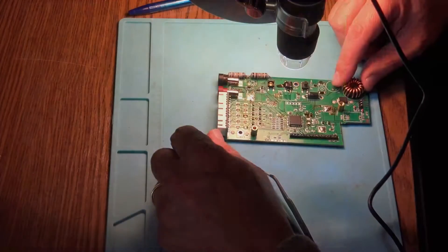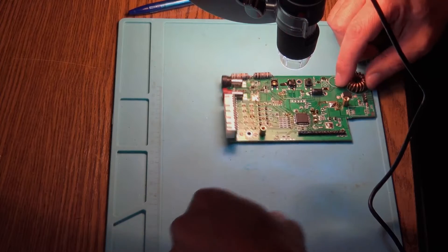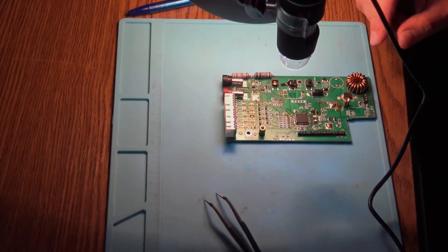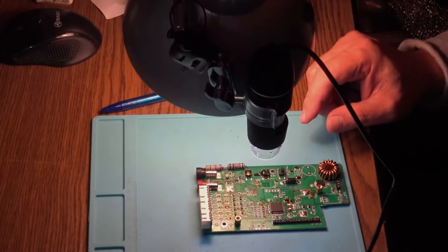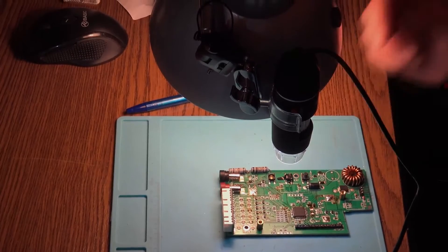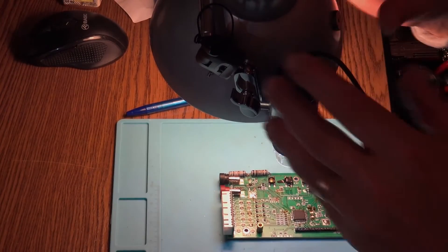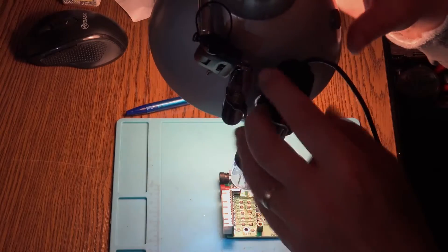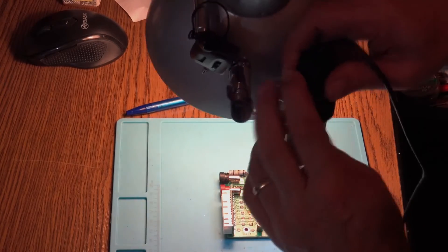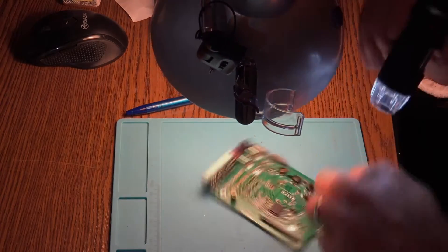So what do you think, guys? Can you use this? I think we can. We have a proper stand and we have proper stability. It can be used very, very nice. And now let's have some tests about maximum magnification.